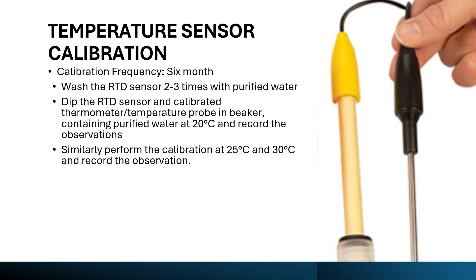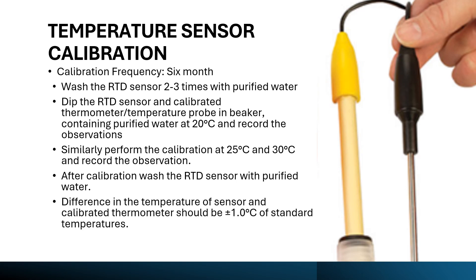Similarly, perform the calibration at 25 degrees C and 30 degrees C and record the observations. After calibration, wash the RTD sensor with purified water. The acceptance criteria is that the difference in temperature between the sensor and the calibrated thermometer should be plus or minus 1.0 degree C of the standard temperature. Calculate the difference between the sensor temperature and the calibrated thermometer temperature — it should be within plus or minus 1.0 degree C.